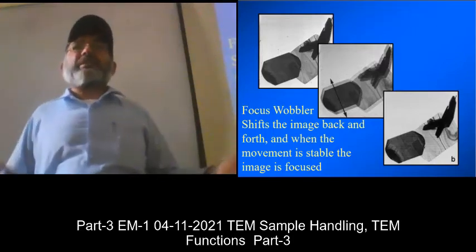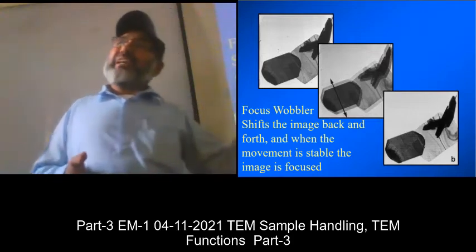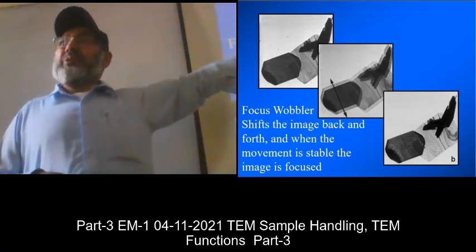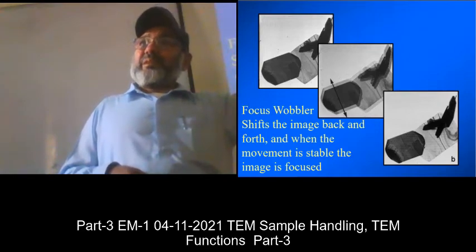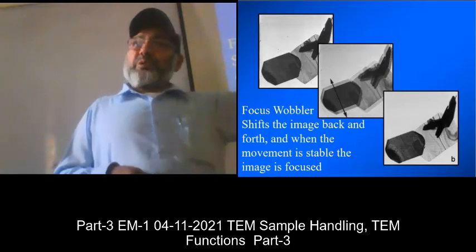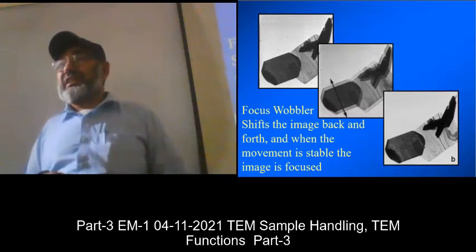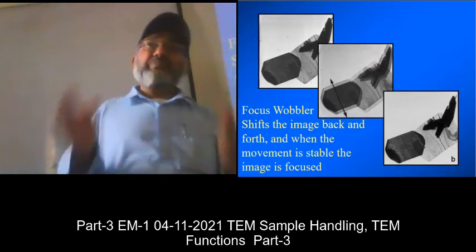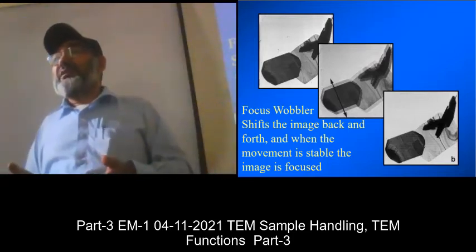An inexperienced person can easily deceive himself or herself if he or she doesn't know the actual focus of the crystal. You can make a rectangle from a square by misaligning the microscope. So always when people get some results from highly sophisticated techniques, they straight away go to the literature, to see whether other people are reporting the same thing or I am reporting something unusual.